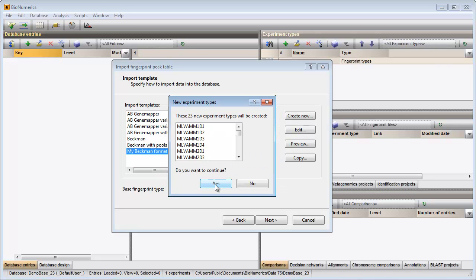For each imported die and pool combination, a fingerprint type needs to be present in the database. The name of these fingerprint types is composed of the base fingerprint type name, followed by the pool name and the name of the die. Since these fingerprints are not yet present in my database, I confirm the creation of the missing fingerprints.